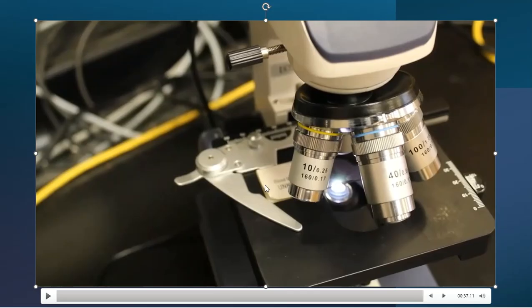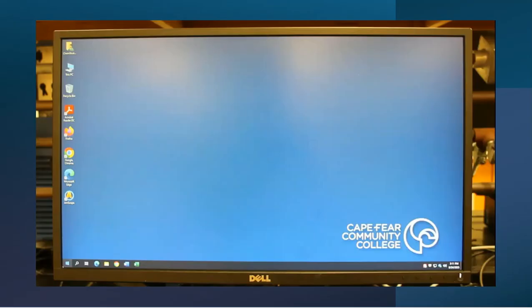All right, guys, so at this point, we've got a slide on the platform. We've got our 4 magnification lens that's ready to go. And now I need to view what I'm looking at on the slide. In order to do that, we need to turn to our computer, which has the software needed to operate the microscope the proper way. I'm getting ready to walk you through how to initiate the software, how to initiate its communication with the microscope, and I'll go through the motions of adjusting the slide on the computer screen so that you can see that in live action.